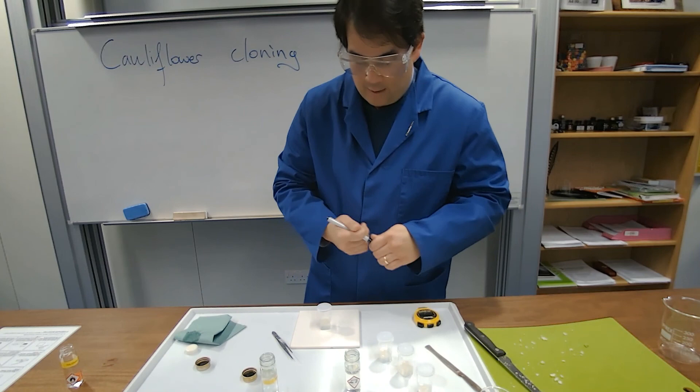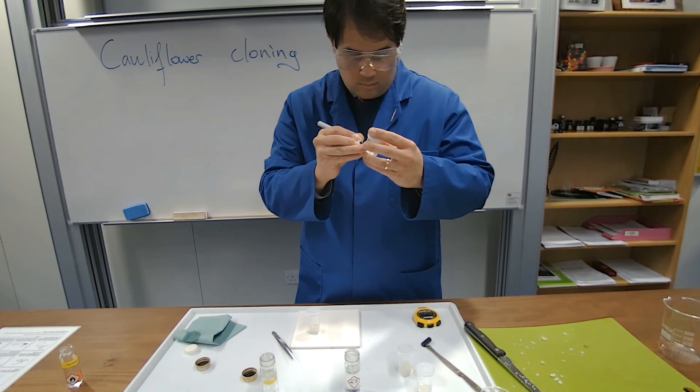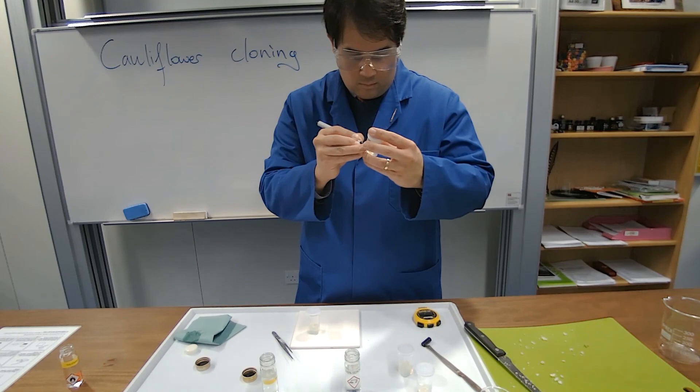Label it with the date and we're good to go. And there you have it. I now have four explants growing on the medium, ready to be put on a windowsill with a little bit of sunlight, and we're ready to clone our cauliflower.